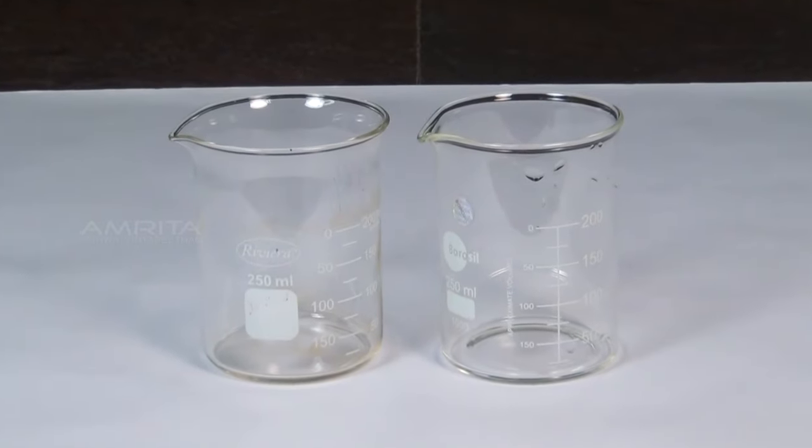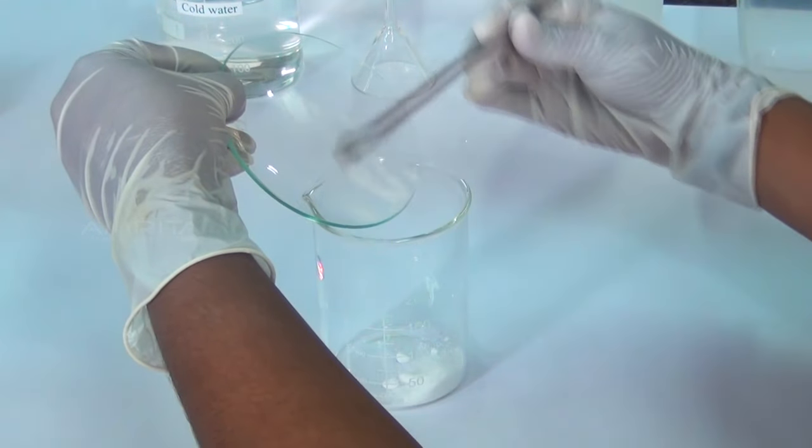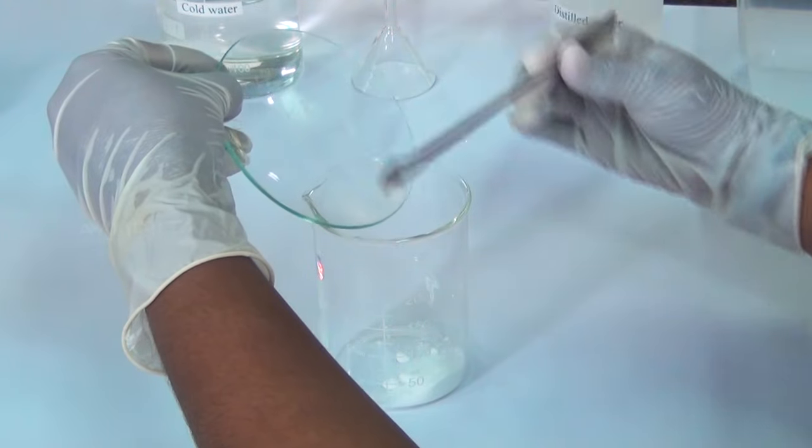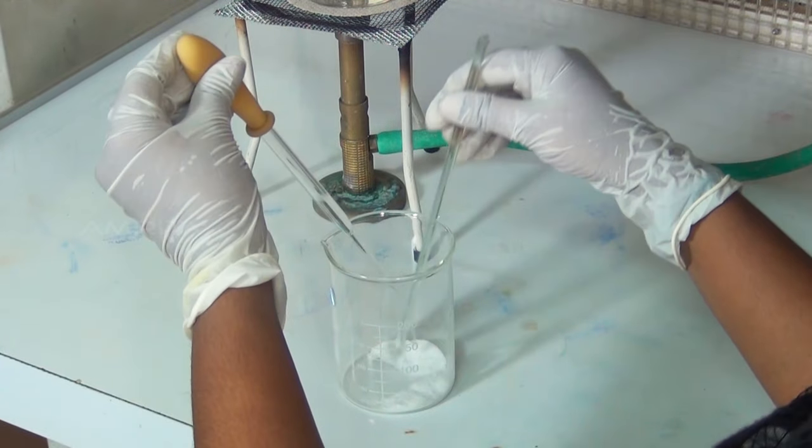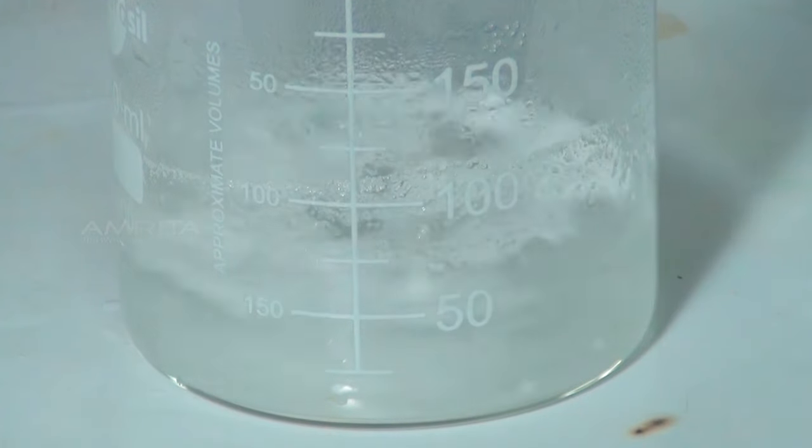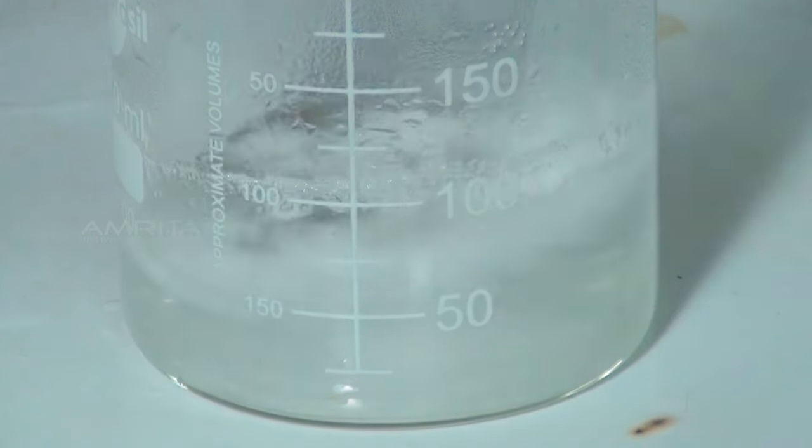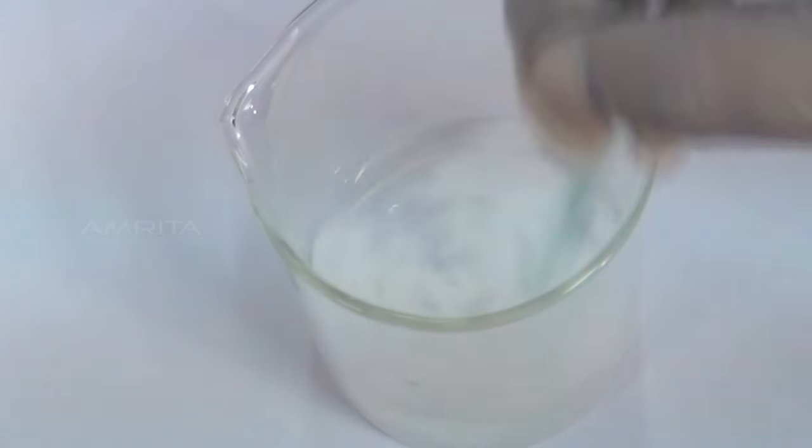In another beaker, take about 3g of crude sample of benzoic acid. To this, using a dropper, gradually add a minimum quantity of boiling water, just sufficient to dissolve benzoic acid. Stir using the glass rod.